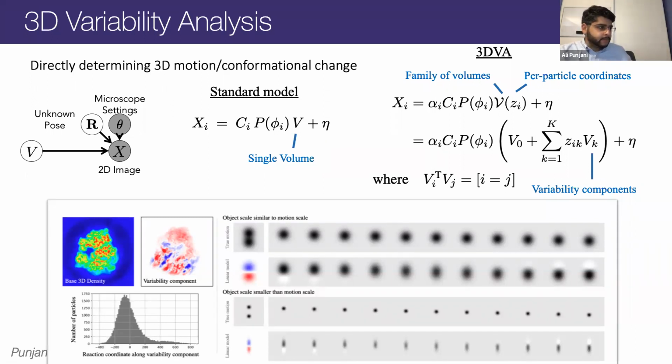Okay. So, Ali, yeah. I have a quick question. How is this different from, say, taking an object, which is the average of all the structures, and then treating each of the individual instances and performing a difference map?